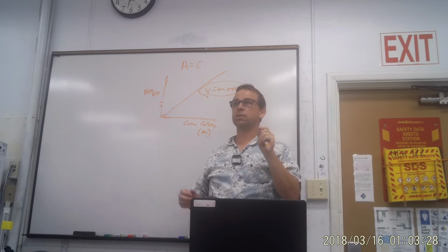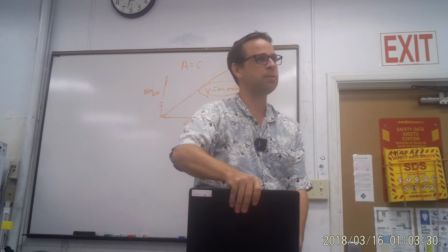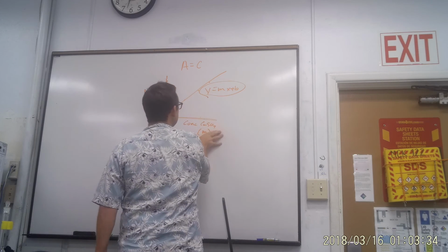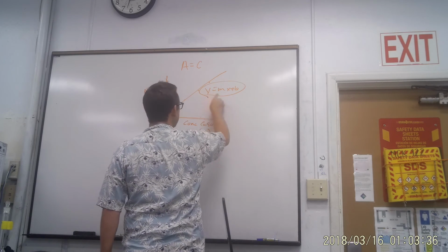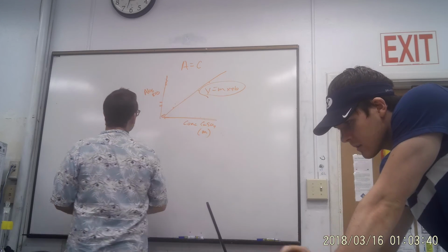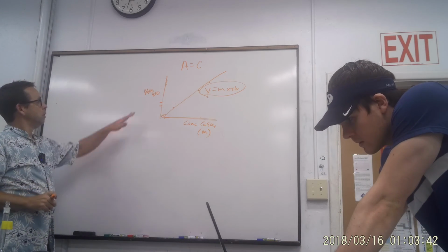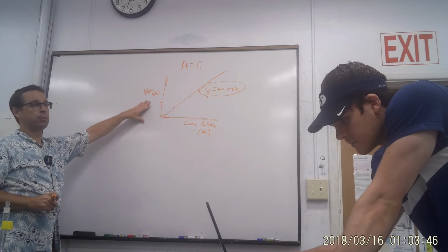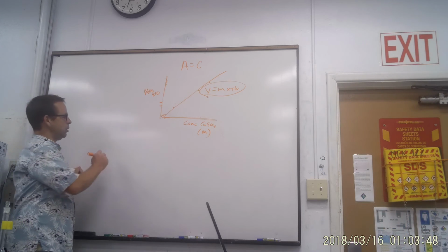It allows us to relate absorbance to concentration with an equation, and the math will tell us how much of the given chemical we're after there is in our unknown.